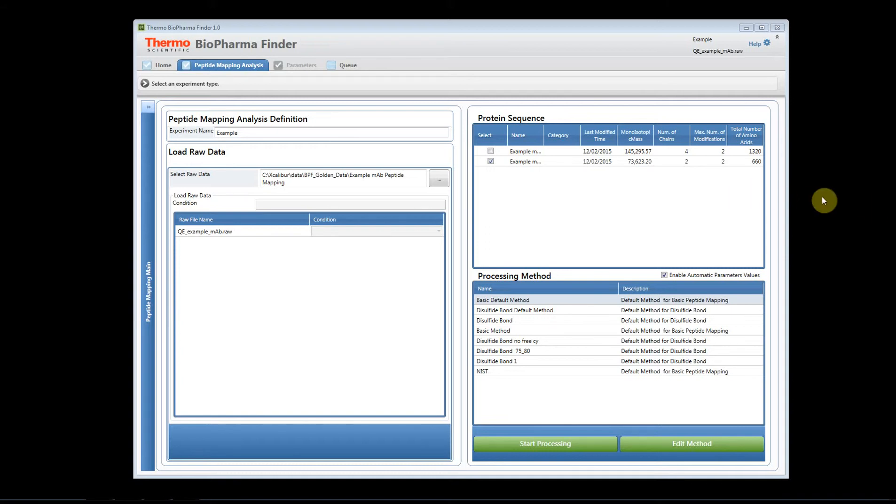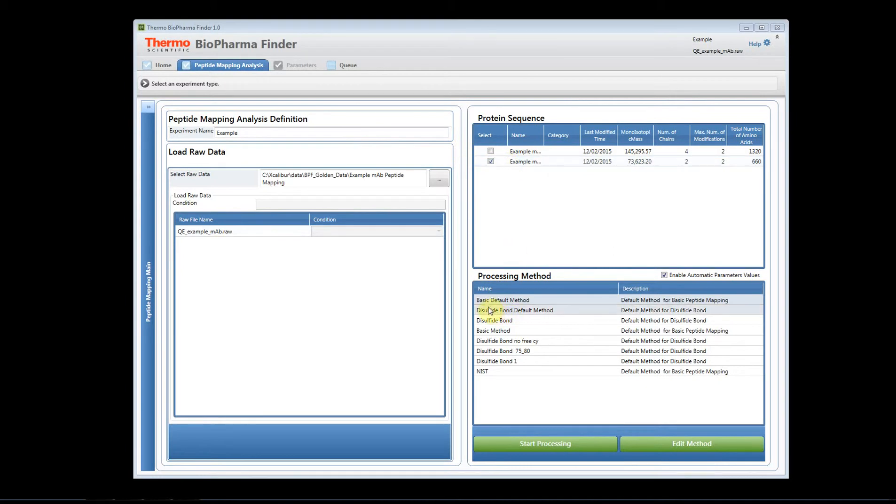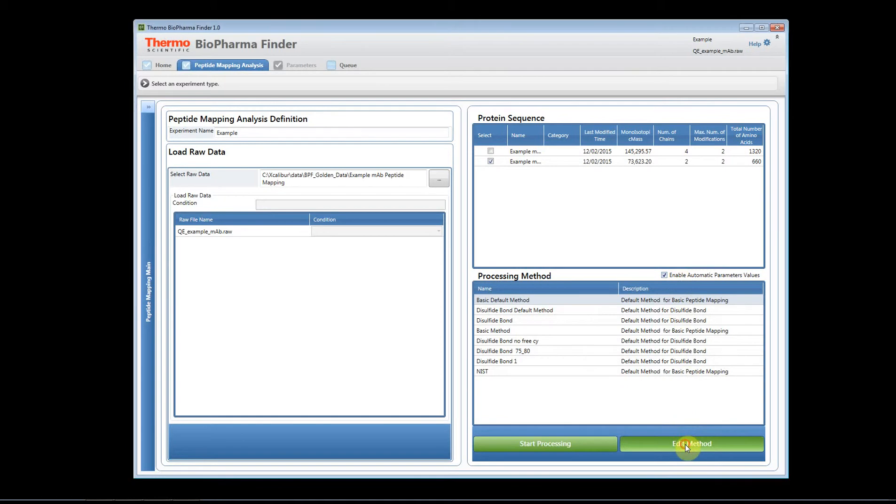Hi, welcome to the Biopharma Finder help videos. In this help video, I'm going to show you how you can edit a method for a peptide mapping experiment. We have a peptide mapping experiment created already, so we've named our experiment, we've loaded our raw file, and we've selected our protein sequence. Now we're going to select basic default method for peptide mapping. We're going to leave our checkbox enabled, and we're going to click edit method.